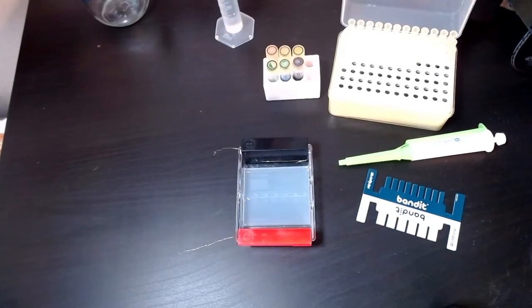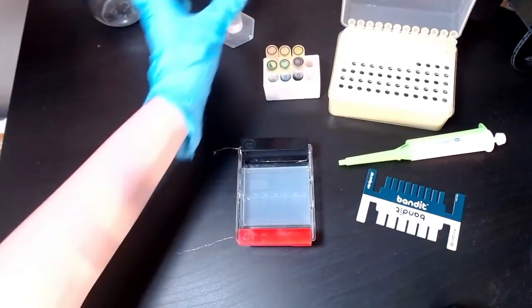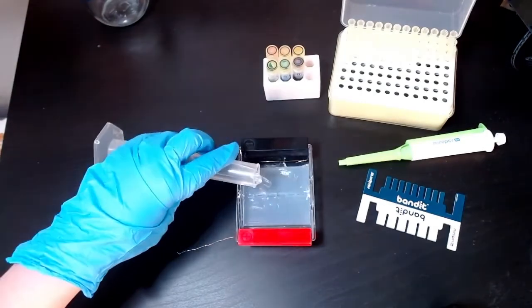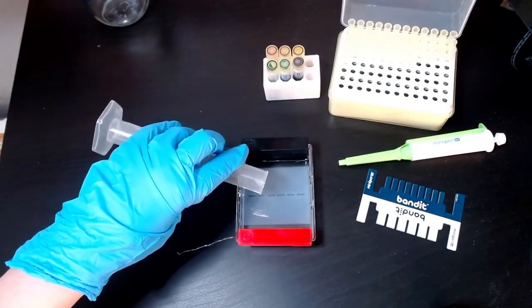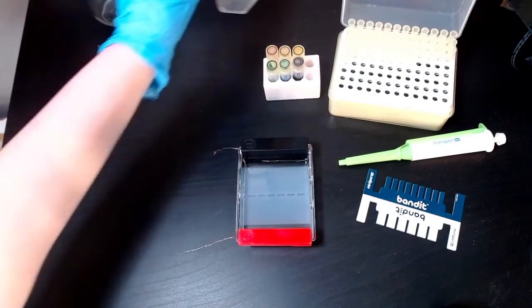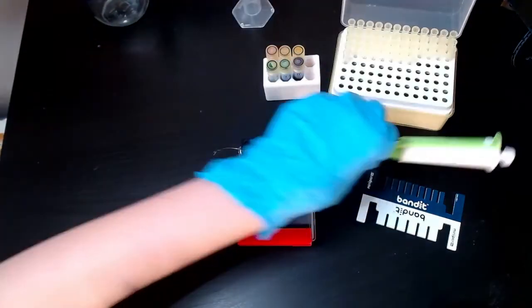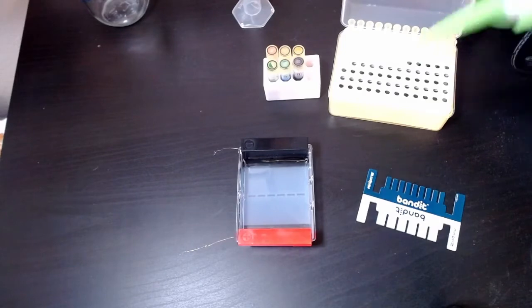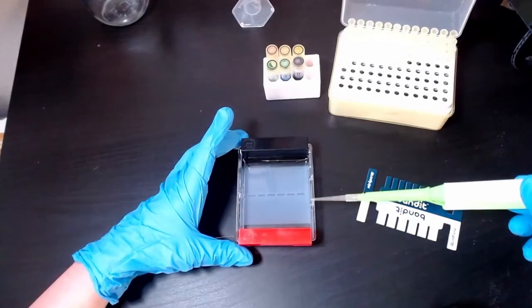So what I'm going to do is first add a little bit of electrophoresis buffer to this gel. And that, of course, is going to be very important when we talk about how electrophoresis works. So I've just added a little bit of electrophoresis buffer. And now I'm going to use a pipette to add 10 microliters of each of these dyes into these wells in the middle of the gel.